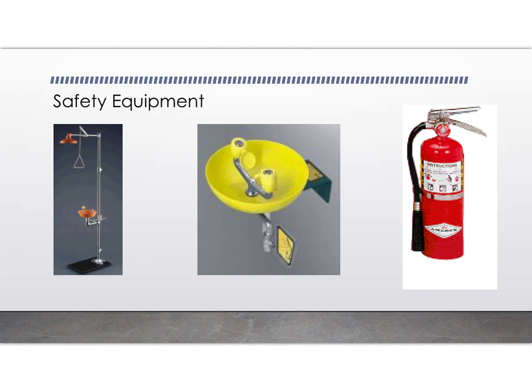If for some reason you get a lot of the chemicals all over your body, you will go to the shower and you will pull down on this triangle ring and a massive flow of water will spout out from the top and it will cover you completely with water. So you do not want to use the water shower unless you actually have to. If you get something really small on your body, please go to the sink, wash it off with soap and water, flush it for about 10 to 15 minutes, and you should be okay.